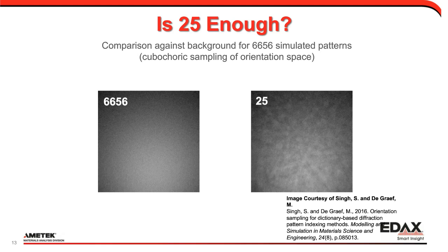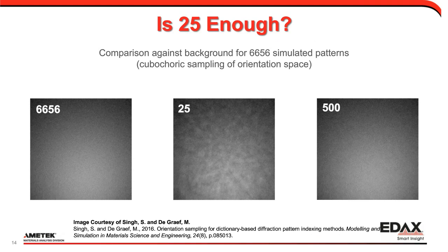So in general, when comparing these, we want to make sure we have enough, but we want to make sure we're not taking too long. In general, the default works. It also depends on your grain sizes and how fast you're scanning. But in general, you want to make sure that you have enough background to get rid of them. So often it's best, when you're initially setting up your scan, to make sure that you have no visible images in the background when it's scanning.